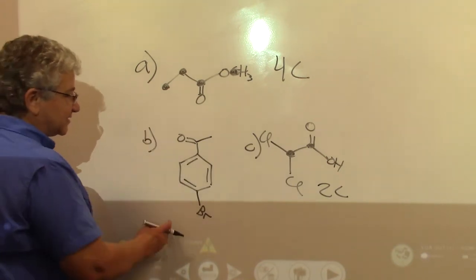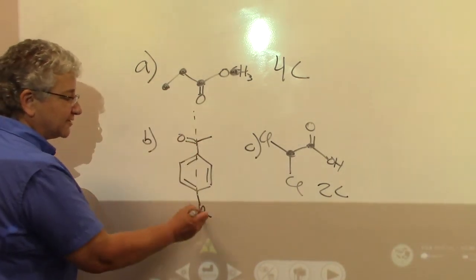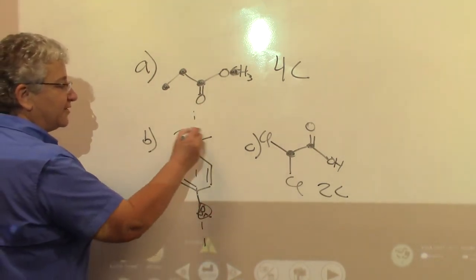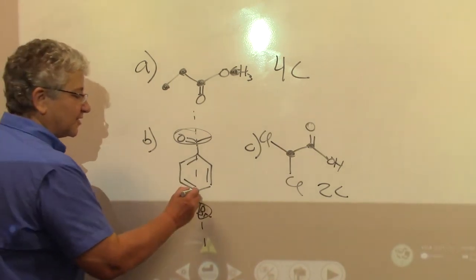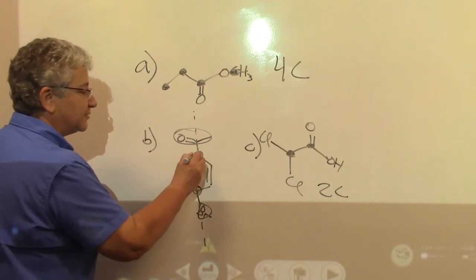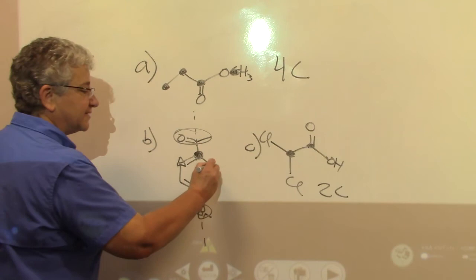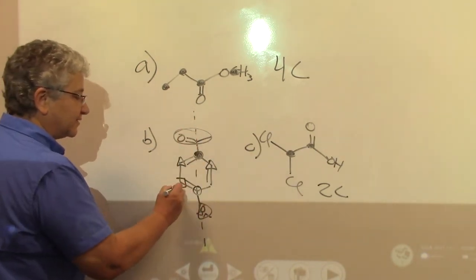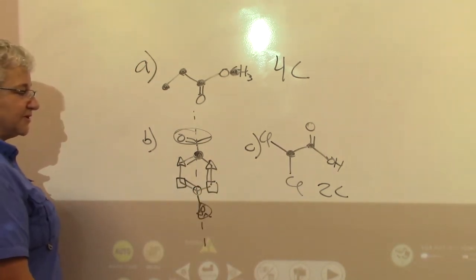And then in sample B, it turns out that there's a plane of symmetry that runs through here. You're going to cut the bromine in half, and you're going to cut this substituent in half. And so 1, 2, 2. Turns out that that is the same as that because of the plane of symmetry, and that the square is the same as that because of the plane of symmetry.